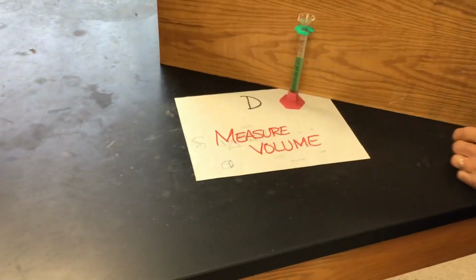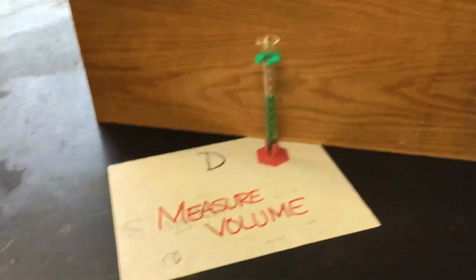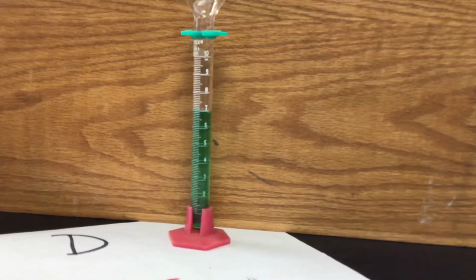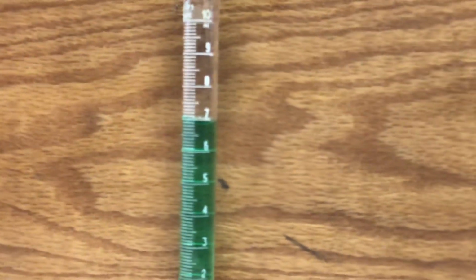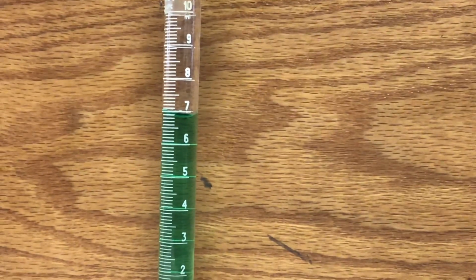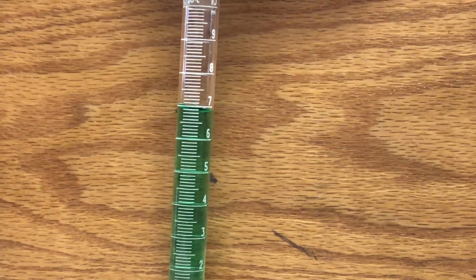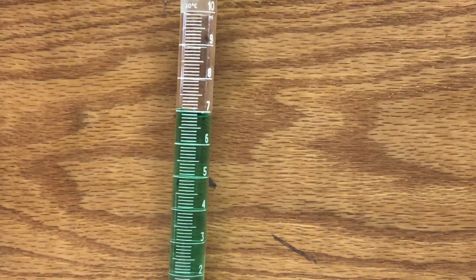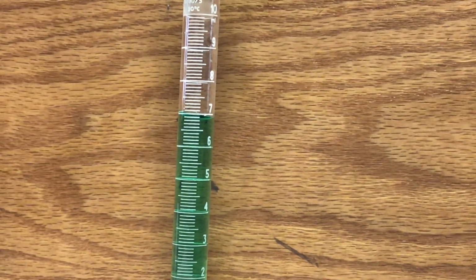Station D is similar to station C. Measure the volume. The only thing is, this is a different graduated cylinder. Make sure you look closely at the graduations. Would you rotate that a little bit, with the numbers toward you? Okay, that's good. Thank you. Do the best you can on that. Look at how the graduations are on this one compared to the last one. Get the volume of that liquid.